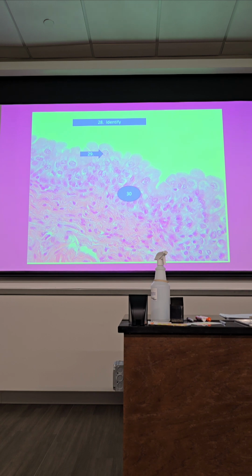What did you say 29 was? 29 is the umbrella cells. It's shaped like an umbrella, right? And the difference between the ureter and the bladder, we can really see that star shape. If you look for the star, it gives it away, right?